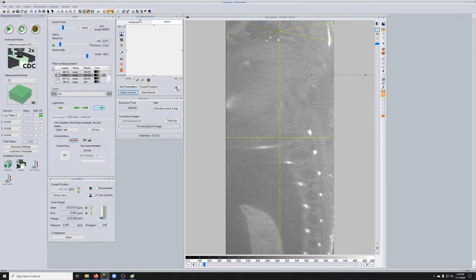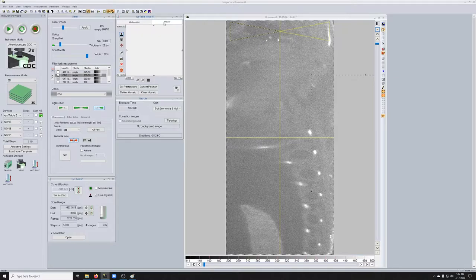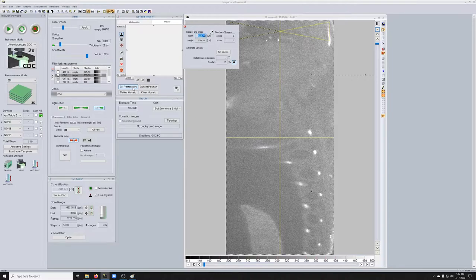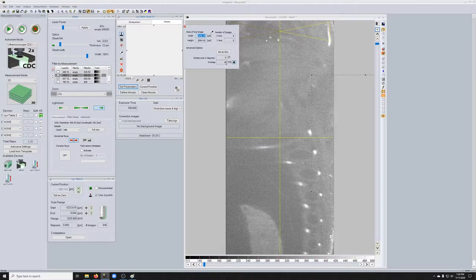So in XYZ table, visual XY, select the mosaic tab. So we select that. In set parameters, under advanced options, set the overlap between 10 to 20%. So we go to set parameters, advanced options, you don't need to rotate, you need overlap. So 10% is usually a reasonable number. If your sample doesn't have a lot of structure, if it has places that are very sort of don't really have a lot of structure in them, this may not be enough because the stitching uses that structure to stitch things together. But 10% is a reasonable starting point.